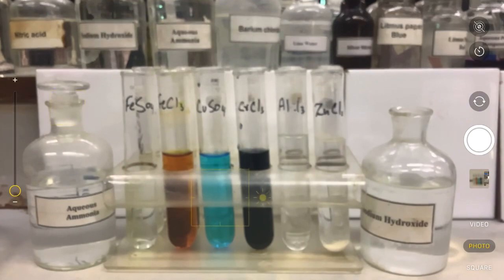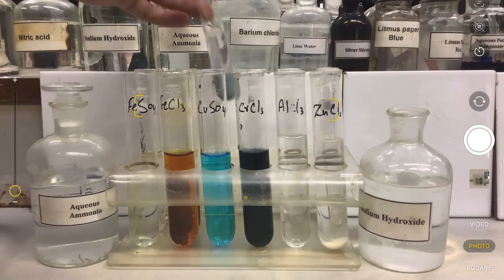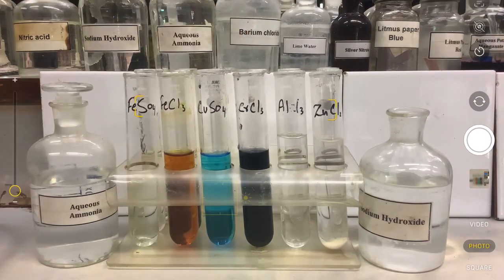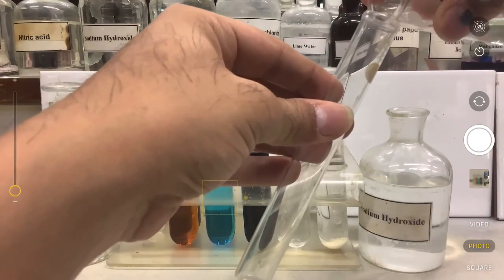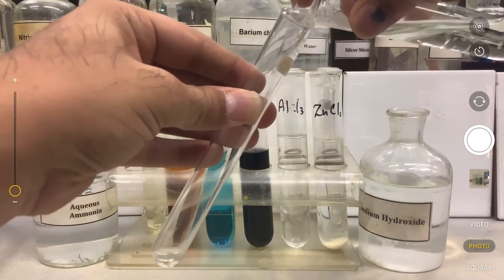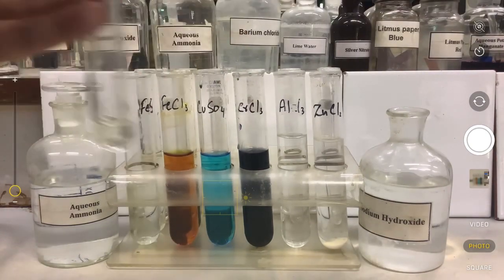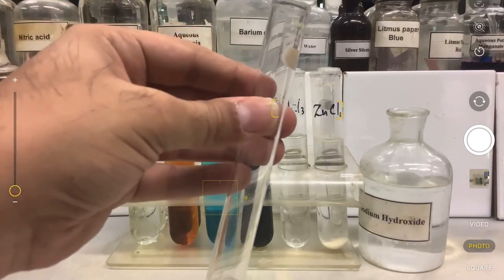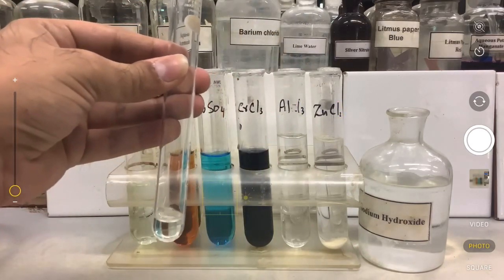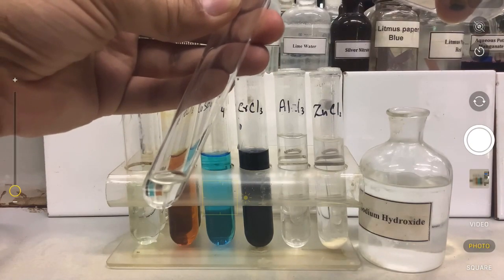Now if you take another clean dry test tube, and you add some amount of iron 2 sulfate. Iron 2 sulfate was a solution, but imagine you didn't know that it's iron 2 sulfate. So you take a sample in a clear dry test tube. Now you're going to add aqueous ammonia, which is the second test performed on the same sample.